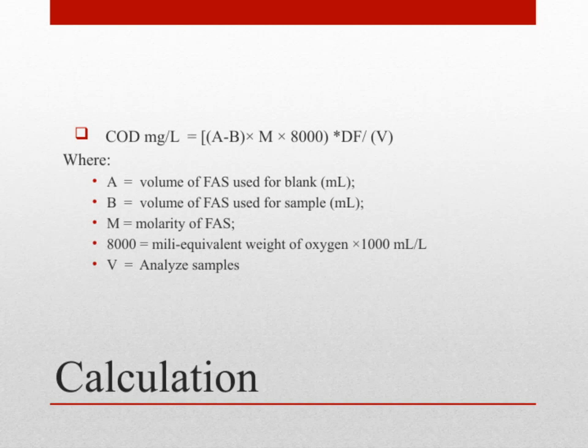Now let's look at the formula for calculating COD in milligrams per liter. The equation is COD mg/L equals the difference between A and B, multiplied by M, then by 8,000, and finally multiplied by the dilution factor, divided by V.